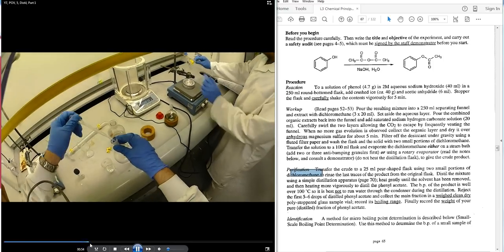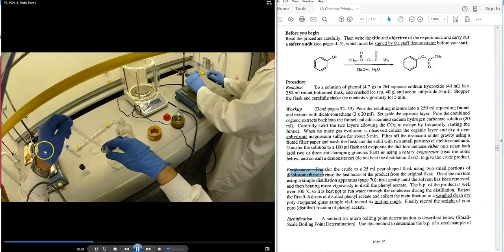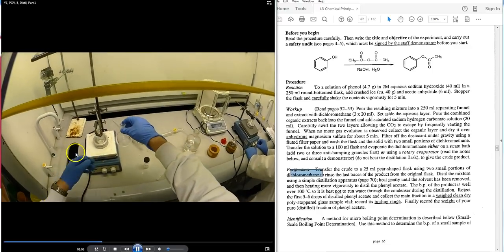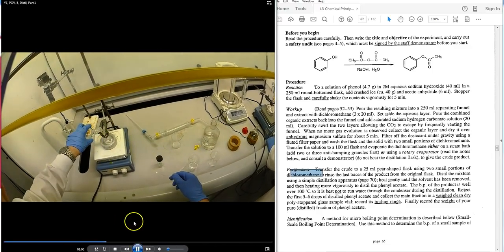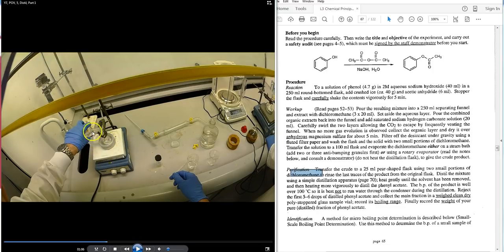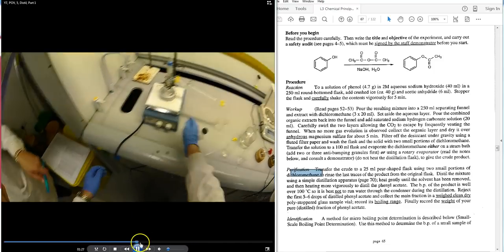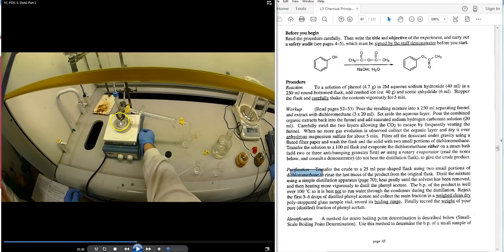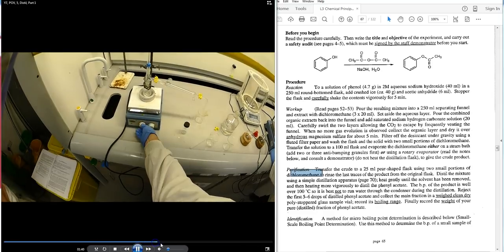The student is transferring material with DCM, swirling and placing it into the neck. It is strongly recommended to use a pipette for this transfer. The student's distillation system shows a heating mantle, stirrer bar, still head clamped and clipped, with the condenser attached. Water should flow in from the tap at the bottom and leave through the top.